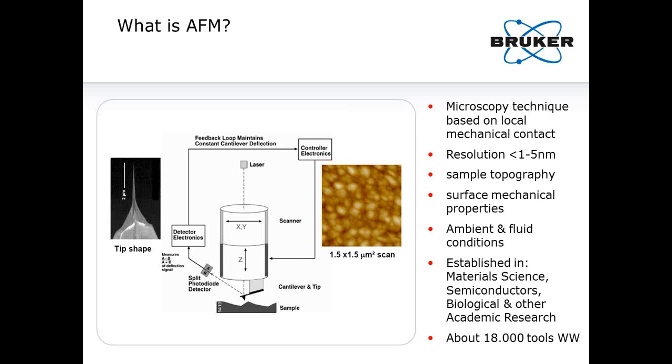First, a quick background. Unlike light microscopy or electron microscopy, which use a focused beam of photons or electrons to interact with and image a sample, the AFM interacts with the sample surface through mechanical contact. An ultrasharp tip is typically in intermittent contact with the sample surface. The tip is on the end of a micromachined cantilever, and the deflection of the cantilever is observed, in most cases through a laser beam that is reflected off the back of the cantilever and into a segmented photodiode.